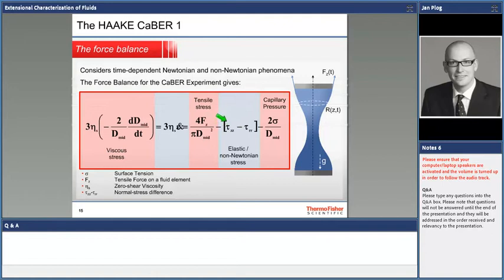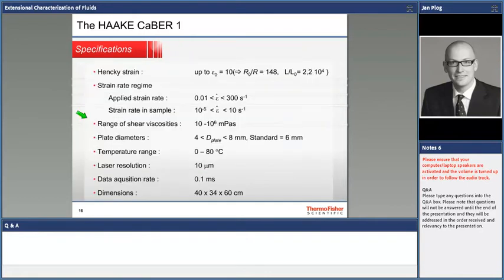Okay, so when you actually start to unravel your polymeric structures, that then will lead to the strain hardening behavior that I described earlier, that I'm going to show you again in more detail on one of the next slides.